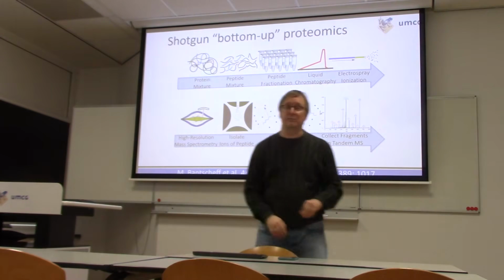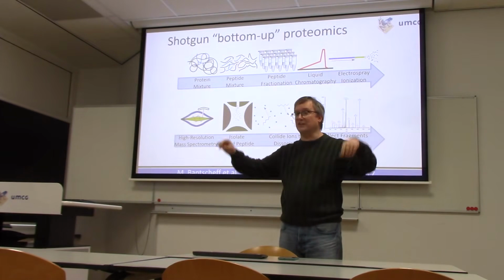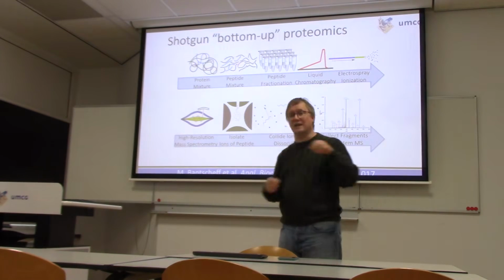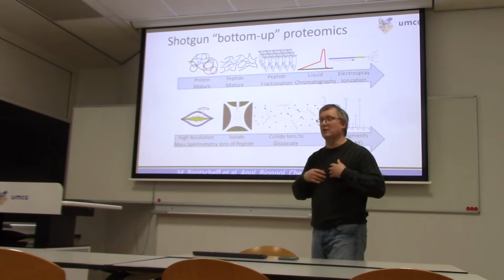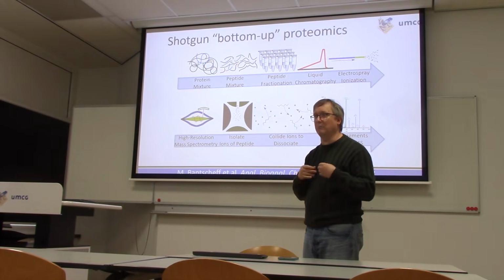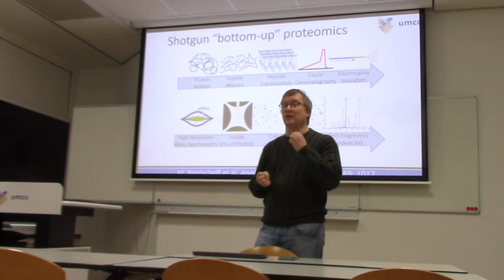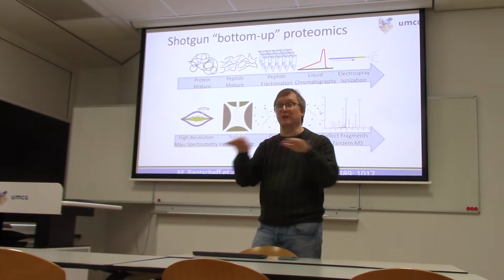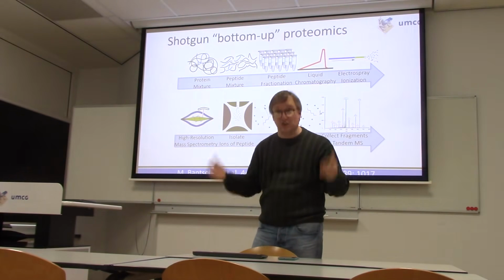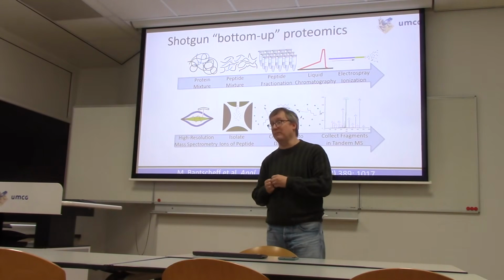So you might, for example, push the pH higher, do an LC separation, and then treat each of those fractions as an individual sample to which LC-MS will be applied. The trouble with this is that the more fractions you split each sample into, the more instrument time is required to make sense of that. And instrument time is always at a premium.